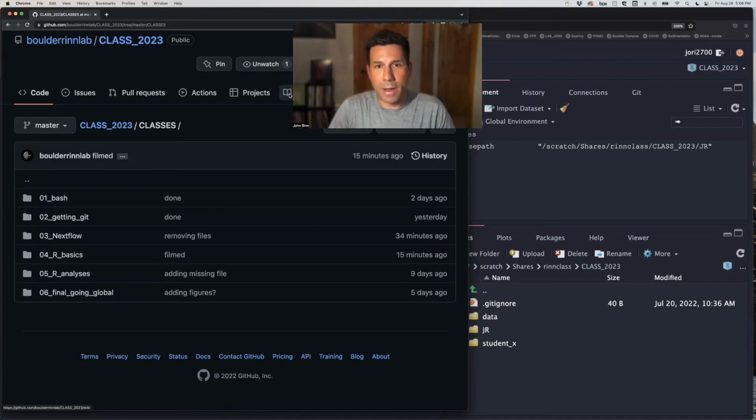Hello, everybody, and welcome to our class where we're going to start to analyze our ChIP data. We're going to use R code and start looking at what these peak files are, what information is in them, and what's important to us as we start to analyze them. I think it's really important to understand the fundamentals of the type of data you're working with and how to maneuver around that. So let's get started.